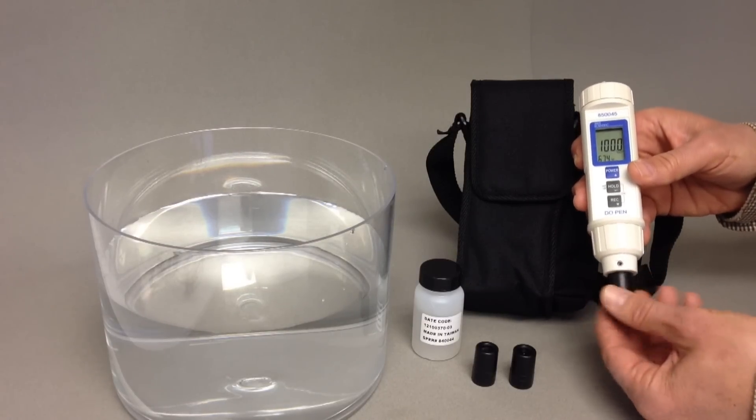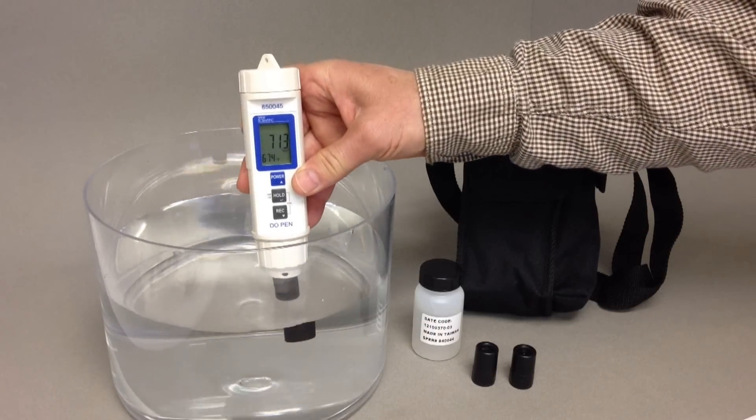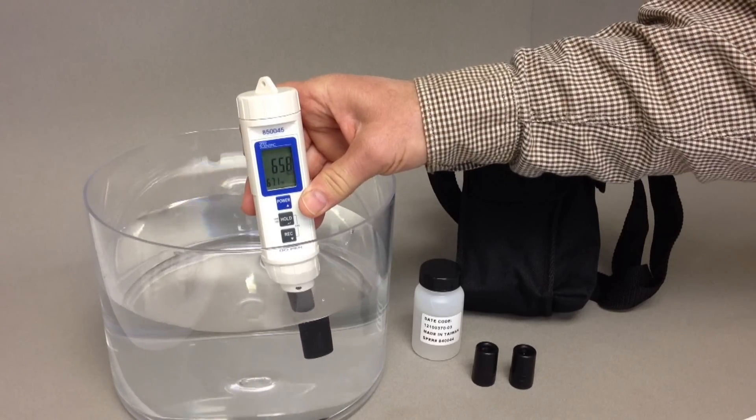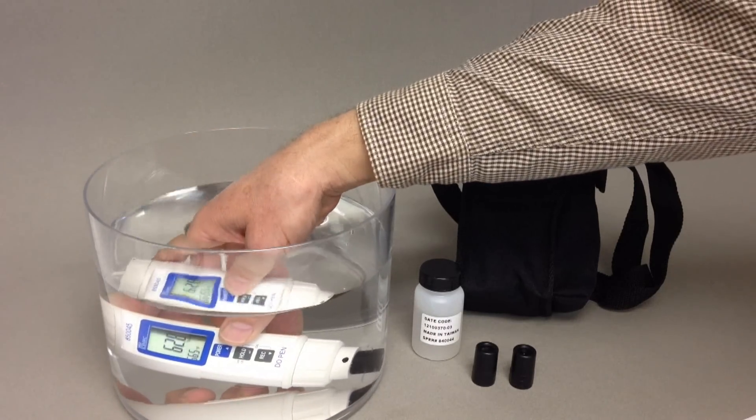No membrane change is required. The large display shows both dissolved oxygen and temperature reading simultaneously, and the pen is IP67 waterproof.